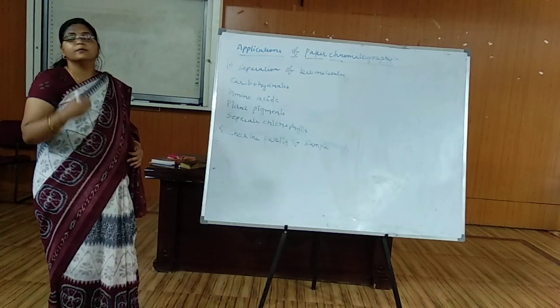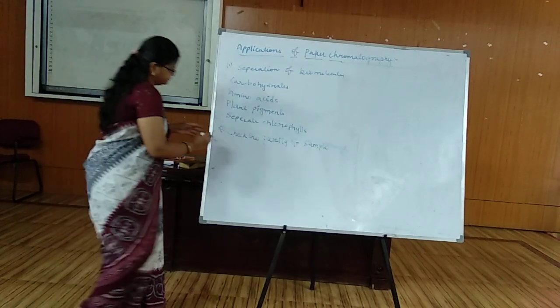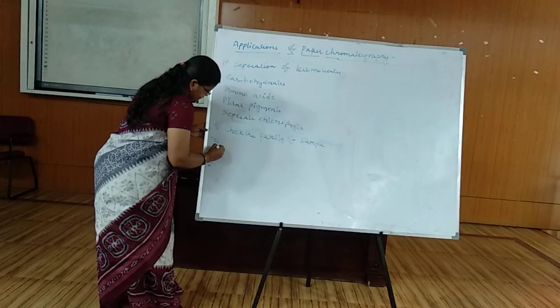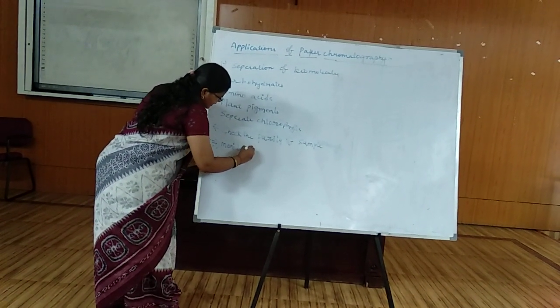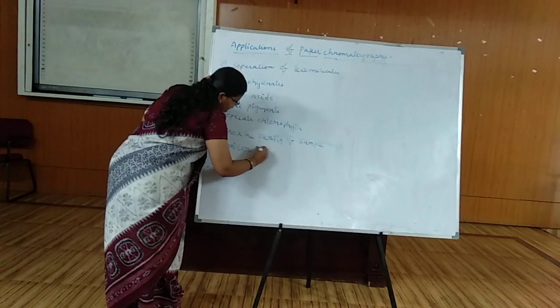You can monitor the progress of reaction.